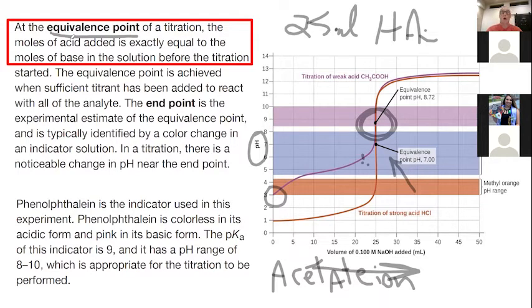So what we want is something to indicate that we've reached the equivalence point, because we're not going to be recording the pH.